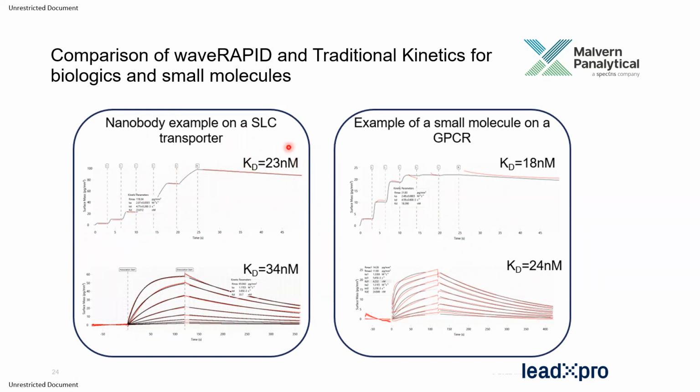with a reported KD of 23 nanomolar. They did a follow-up assay with traditional kinetics. They were able to see very similar binding parameters, with a KD of 34 nanomolar.